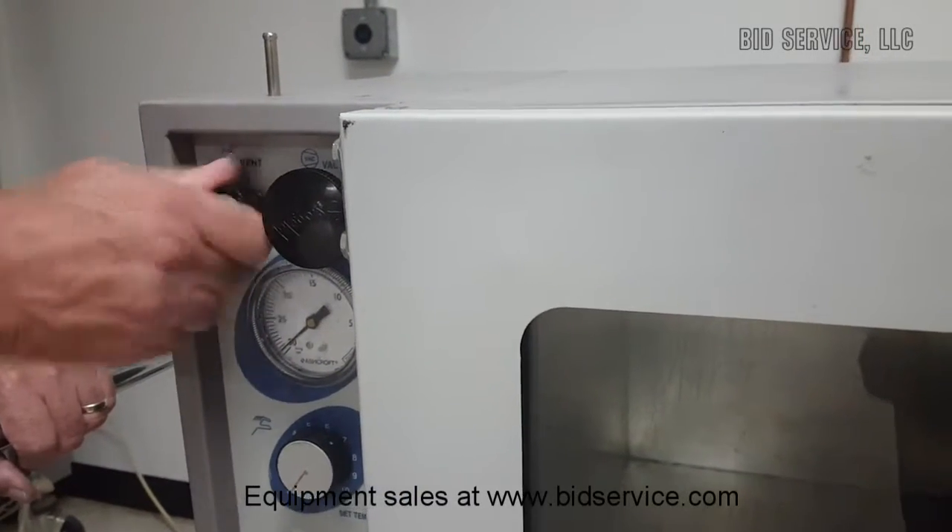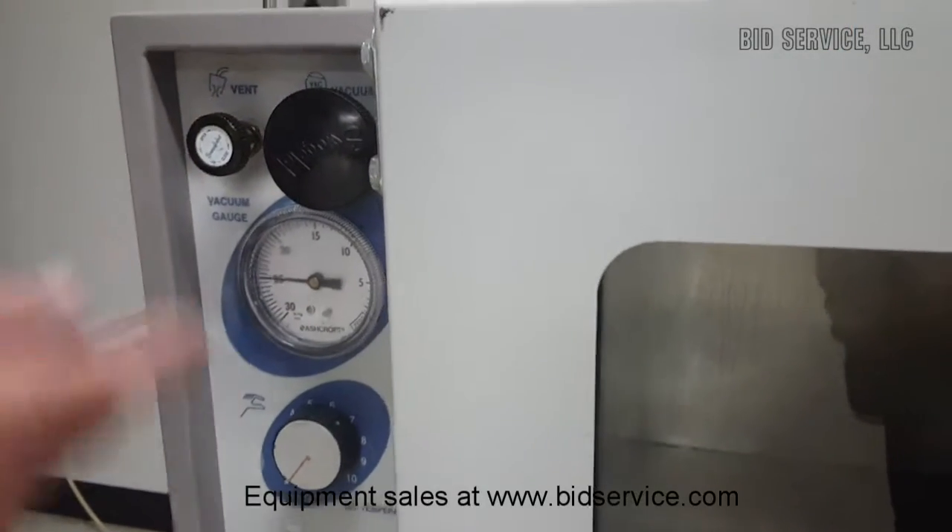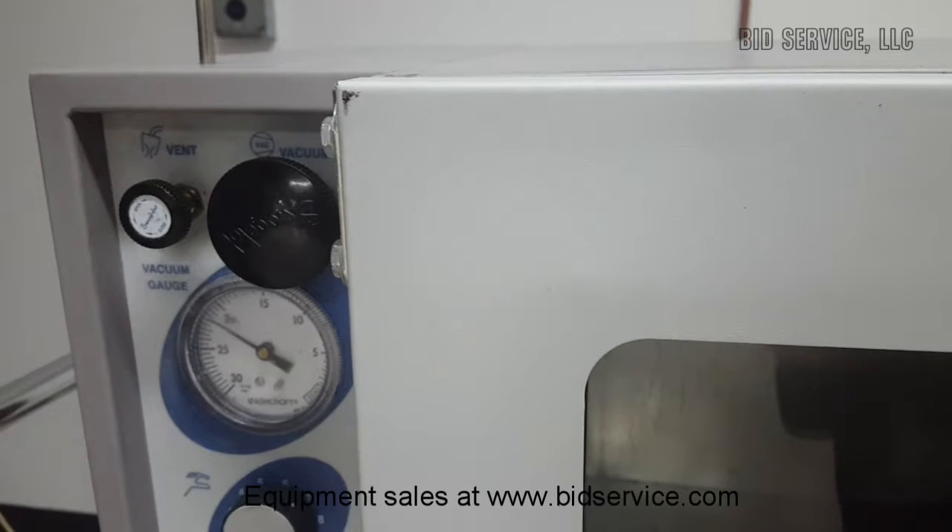Now that you've seen it's under vacuum, I'm going to open up the vacuum and open up the vent valve, and you can hear it as the chamber fills with air.